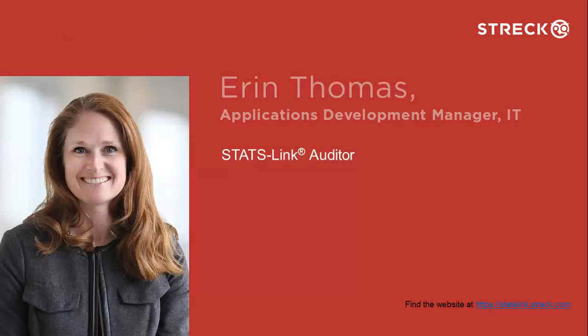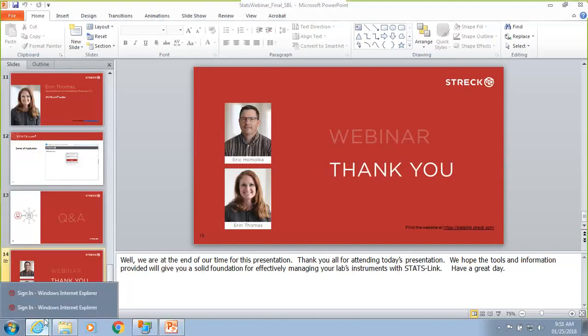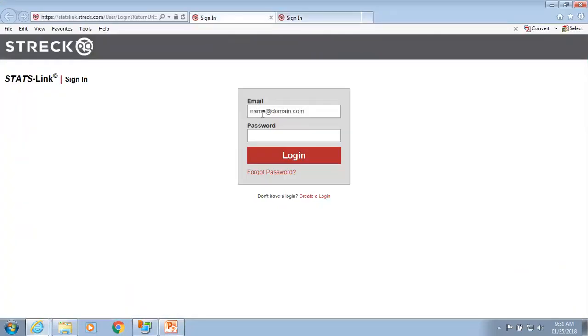We will begin today by using Internet Explorer because it is the most challenging browser to target. We will use 3 accounts, Stats Data UAT, Webmaster, and eThomas as an admin. We will look at new customer enrollment, so signing up for STATS-Link, joining an existing account, data submissions, and reporting. We'll begin by opening up the website here, the application. And I'm going to log in and show you some of the helpful information that's available.